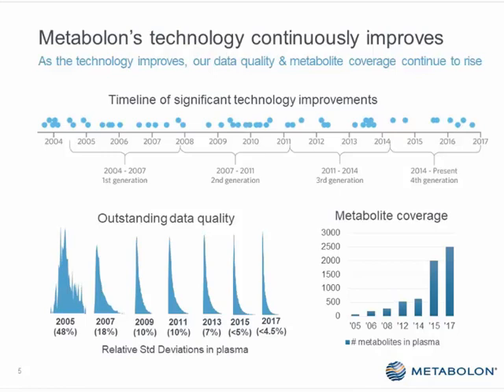When you look at a wall chart of biochemistry, we're covering 80% to 90% of all the biochemicals on those wall charts. Biochemistry is relatively finite. There's a unique set of biochemicals that the human body can synthesize, then there are the metabolites that come from bacterial metabolism, and then there are also xenobiotics. When you have a technology that can look at all those different classes of molecules simultaneously, we're now getting a pretty complete picture, from where we were even 6 or 7 years ago.